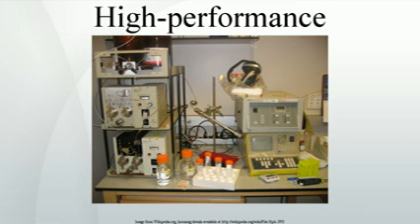Operation. The sample mixture to be separated and analyzed is introduced, in a discrete small volume, typically microliters, into the stream of mobile phase percolating through the column. The components of the sample move through the column at different velocities, which are a function of specific physical interactions with the sorbent, also called stationary phase. The velocity of each component depends on its chemical nature, on the nature of the stationary phase, column, and on the composition of the mobile phase.